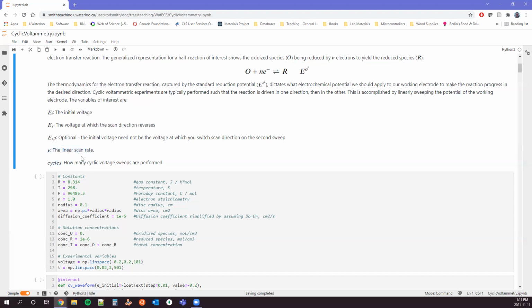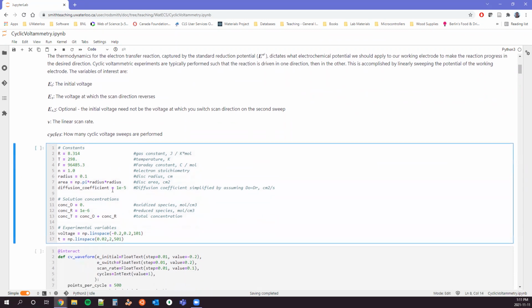And so it's important to kind of probe, look for the steady state. What we often see is kind of a gradual shifting in behavior over time. If you want to have good results to analyze, you want to be as close to a steady state as possible so that each subsequent cycle gives you the same results.